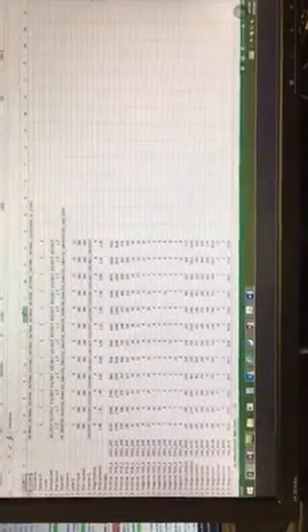All right, so let's take a look, and this is probably very similar to the Excel sheet you were looking at before. This actually looks okay. Is that lane 8? Yeah, lane 8 was the one that was flagged. So I'm going to just highlight it so we can take a look. So the whole sample is flagged? Well, it's flagged. I can tell you why it was flagged. It was flagged because the positive controls are a little low there.